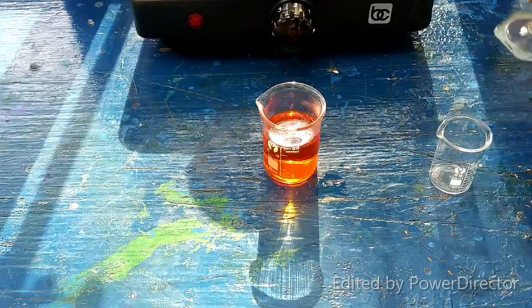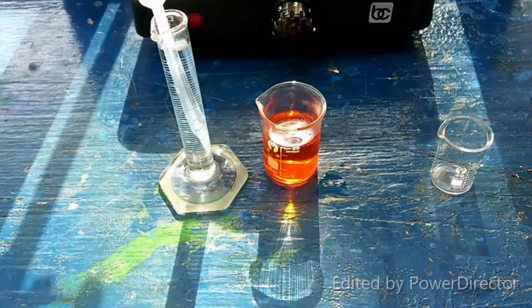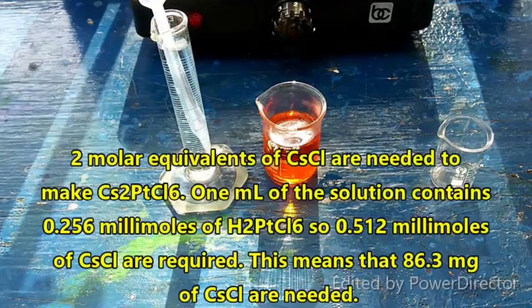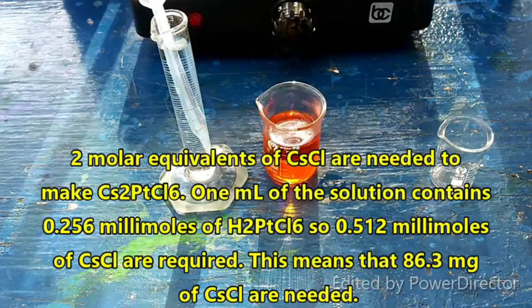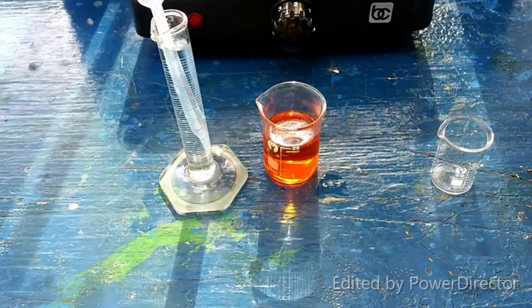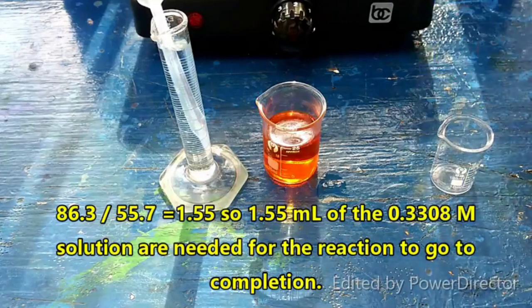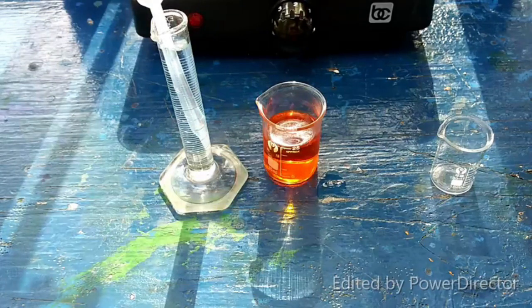And 1.54 milliliters of this 0.3308 molar solution of cesium chloride. I don't really trust anything that I've got that will measure volume on this scale. I've got some pipettes that are the good kind, but then I have to clean them, and that's just a royal pain. So, because I'm lazy, we're just going to do this by mass, and we are going to assume that because these are fairly dilute solutions, they will have about the same density as water. So, we're going to go with that.